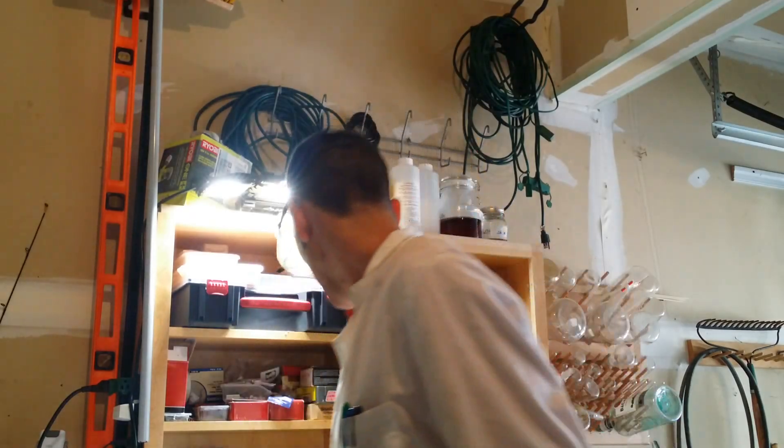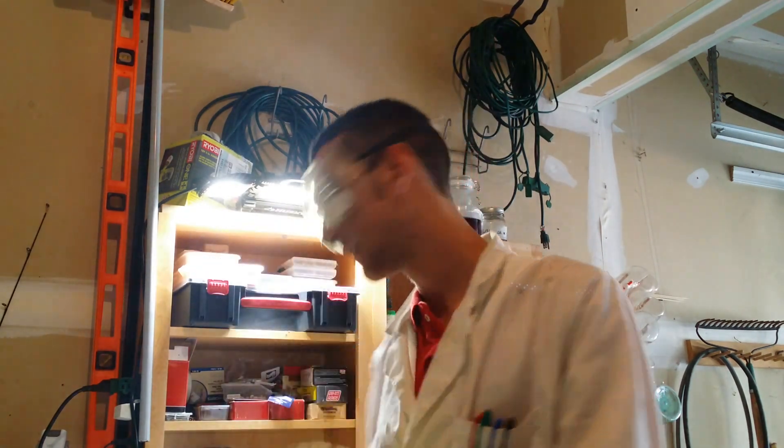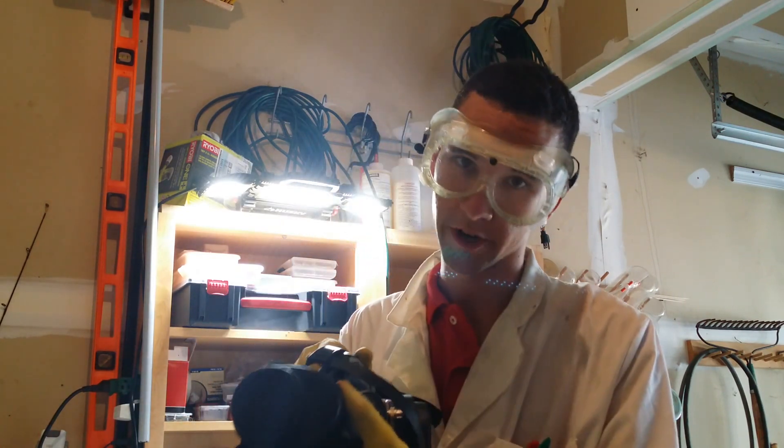Gloves, a lab coat, goggles — preferably sealed, so I'm going to improvise with pool goggles. You really do not want the vapors touching your eyes. And either a fume hood or a respirator.